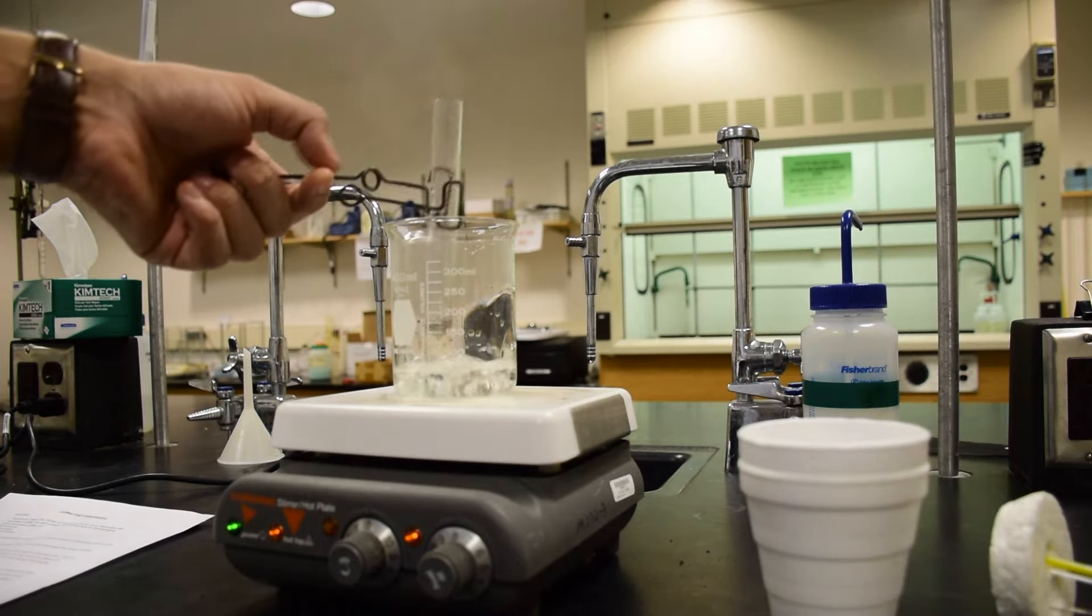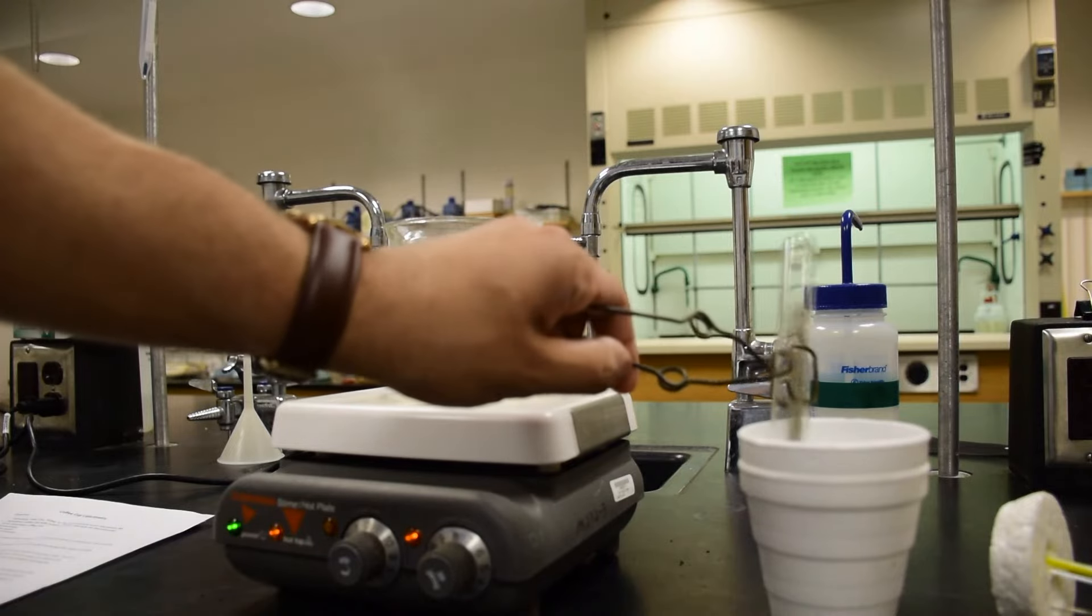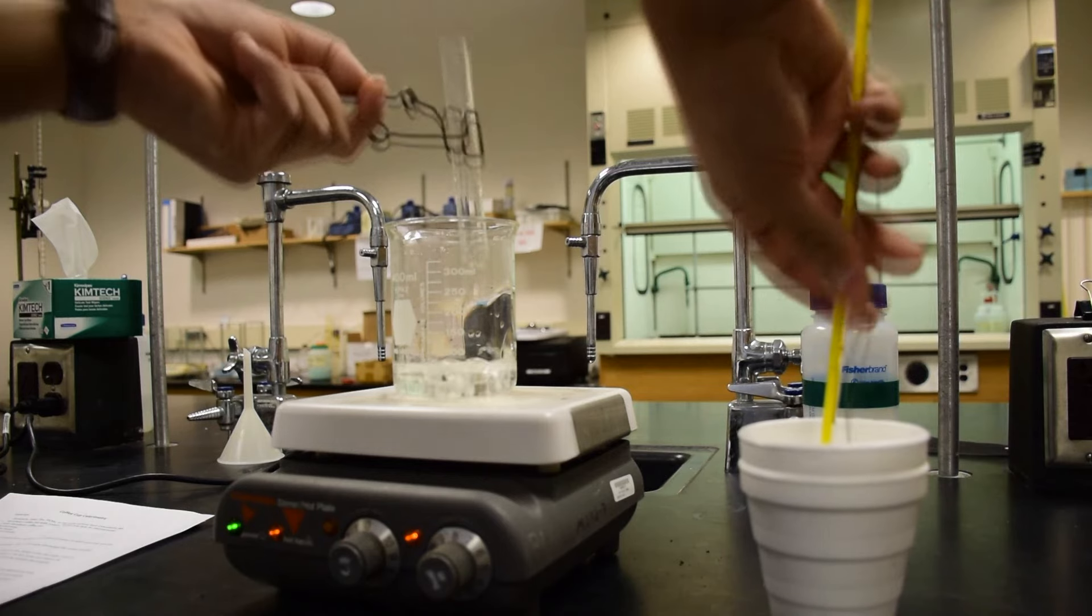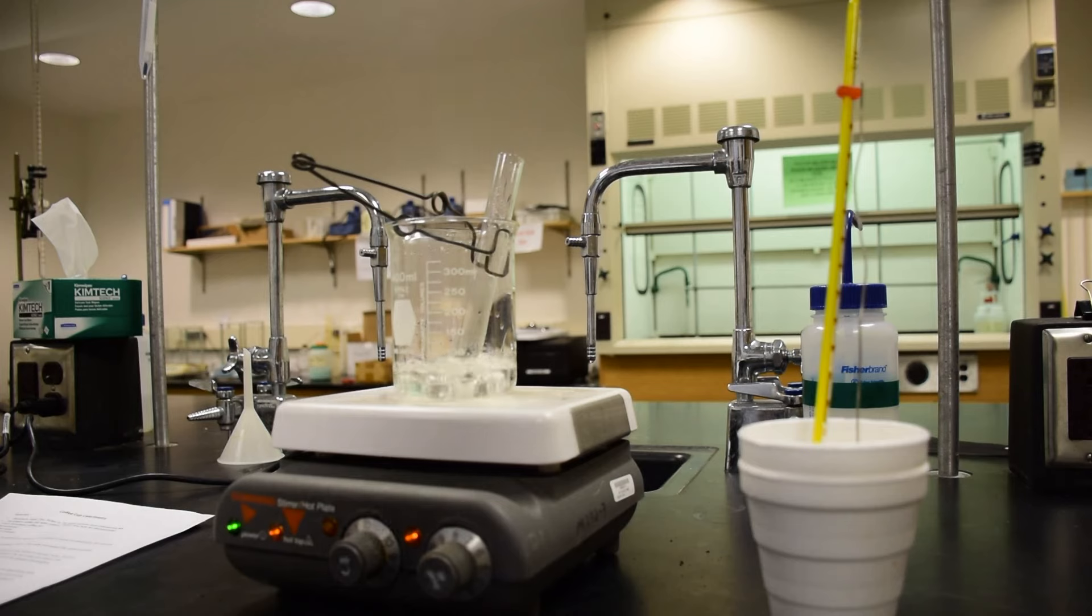Remove the test tube from the boiling water and transfer the metal out of the tube into the coffee cup calorimeter. Remember to do this quickly, otherwise the metal will quickly lose heat. Don't splash the water from the calorimeter and don't break the thermometer.